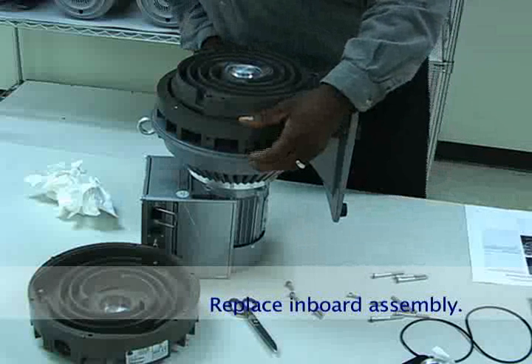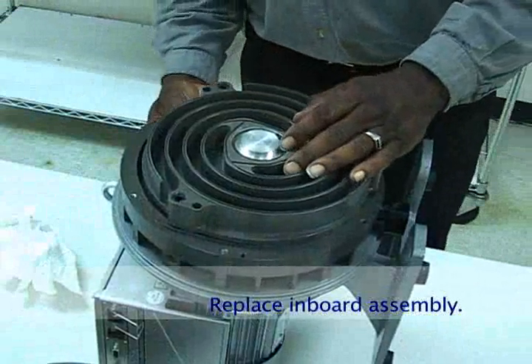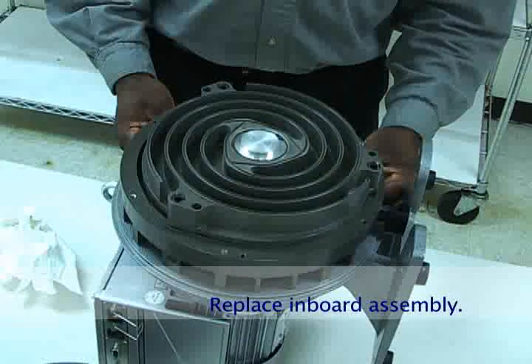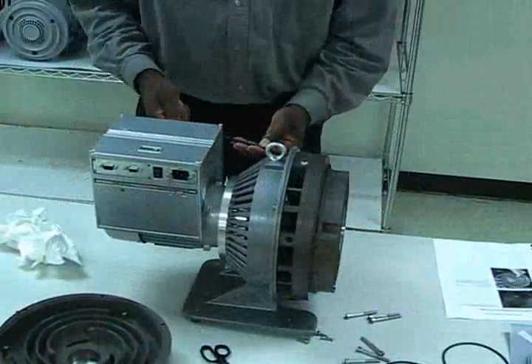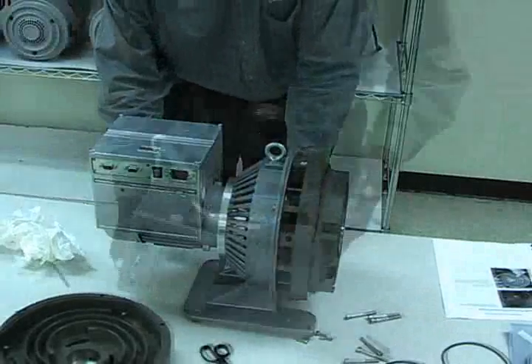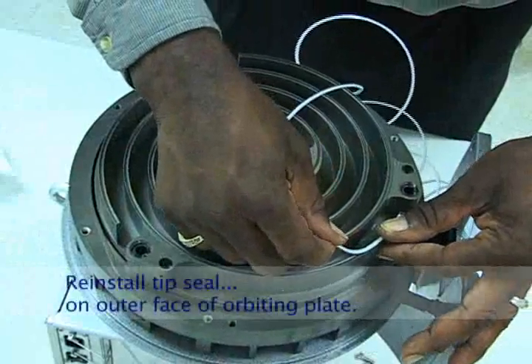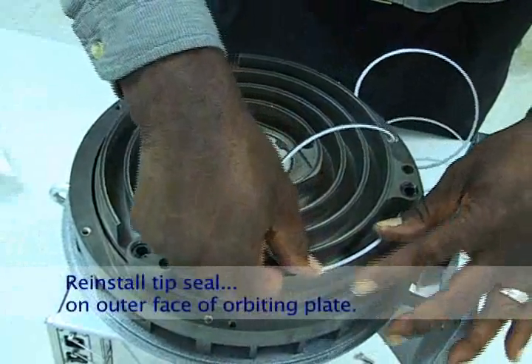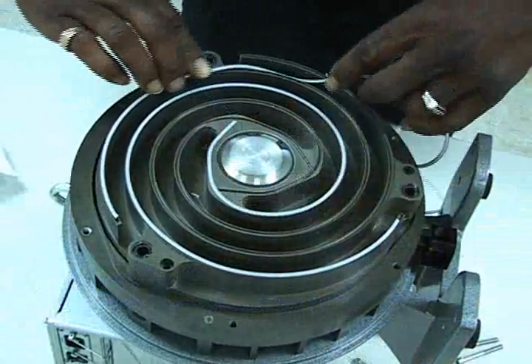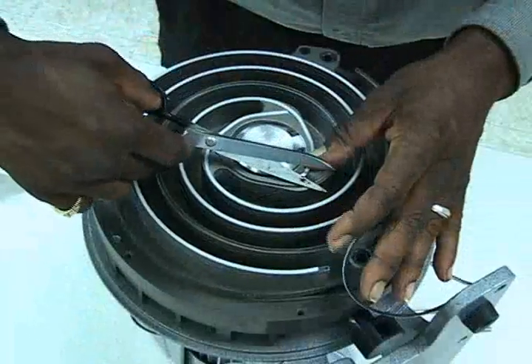Ensure that the dowel pins fit properly in the mating holes in the frame. Install the four M6 screws attaching the inboard assembly to the frame. Set the pump upright and tighten the screws. Set the pump back on end and install the tip seal on the outer face of the orbiting plate using the same procedure as before. Remember to leave a quarter inch gap for thermal expansion.